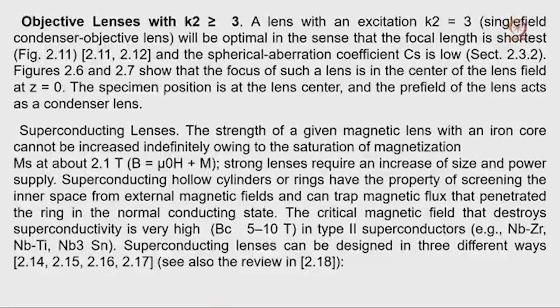Now, let us go into a little bit about the condenser lens system. If you remember, we can discuss a little bit more about what this condenser lens system is doing. We already discussed the objective lens system.